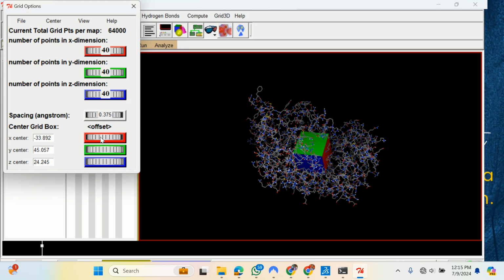If you change anything here, this will certainly change. Look at what I mean now. If this goes this way and then this goes this way, are you noticing anything? You get that now? So automatically this will keep changing. But we need to locate where our own is.